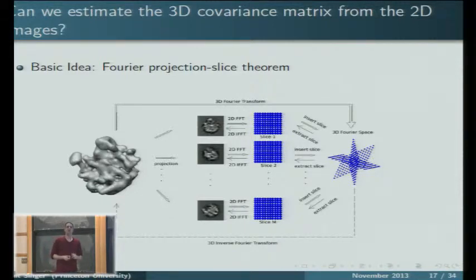Which means that, what does it mean that I need to get the covariance matrix? I need to get the covariance between any two frequencies now. Okay? So Tom chooses two frequencies, and he asks me to find the covariance between them. So he gives me the two frequencies, and now I know that there is going to be a plane that goes through these two frequencies and the origin. Three points determine a plane.